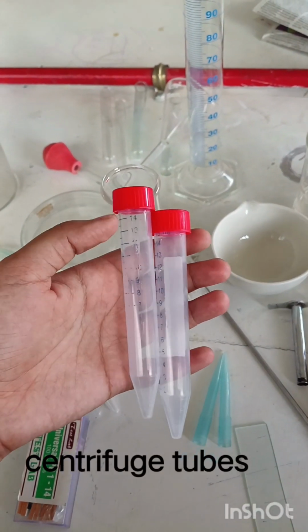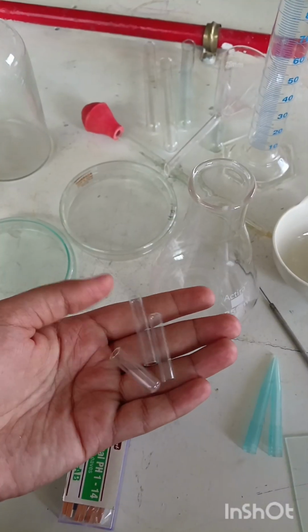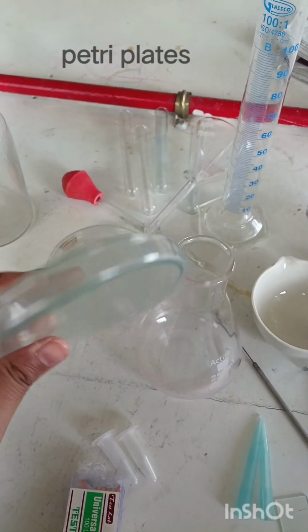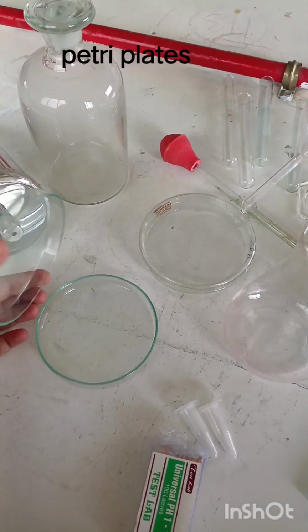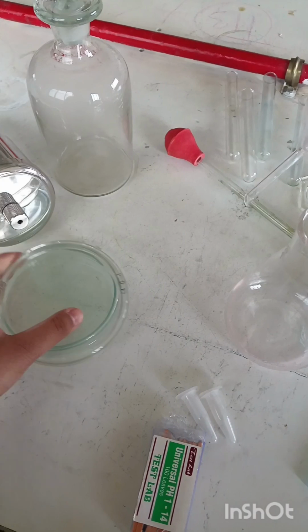These are centrifuge tubes, used in a centrifuge to separate components of a mixture based on density. These are Durham tubes, small inverted tubes to detect gas production. These are Petri plates, shallow circular dishes used for culturing microorganisms on solid growth medium.